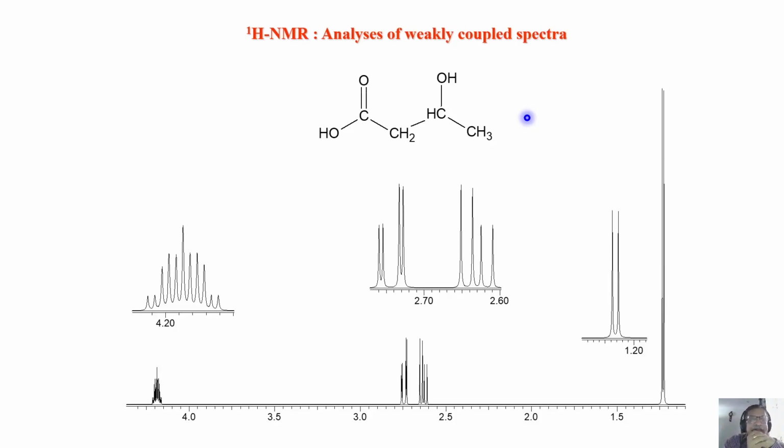Now, look at this spectrum of this molecule. It is a proton spectrum. If you look at it, how many groups are there here? There is CH3, CH, OH, CH2 and OH. So 1, 2, 3, 4, 5 different groups of protons are available here in the spectrum. Let us look at this one. There is one group here, one here, one here, one here. What is happening to the other one? We will see where the other things are later.